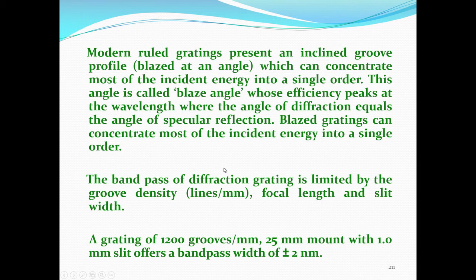Modern ruled gratings present an inclined groove profile. That means the gratings are not drawn perpendicularly, but at an angle. These can concentrate most of the energy into a single order. This angle is called the blaze angle.